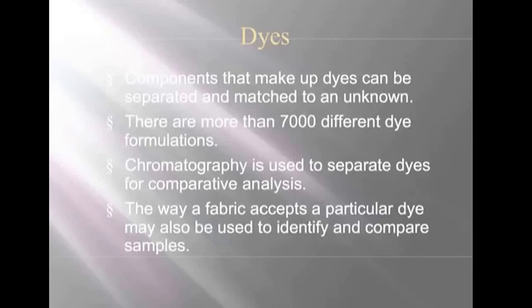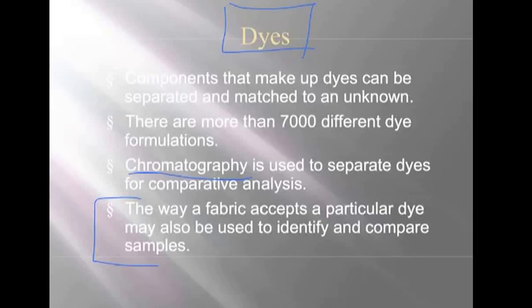Another big clue when we do fabric testing is understanding the different types of dyes that are used, and this is what your lab is based on, which is understanding how the dyes that are in the fabric react with new components that are added. So chromatography is a separation of dyes, and then this is the one that our fabric lab focuses on. The way a fabric accepts a particular dye is going to be totally different. So what may look like just a white fabric, when treated with different dyes, it will react differently.